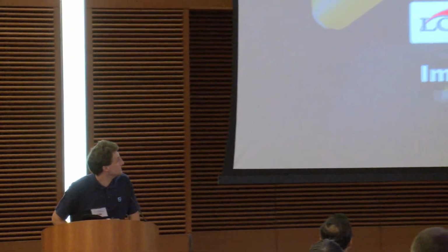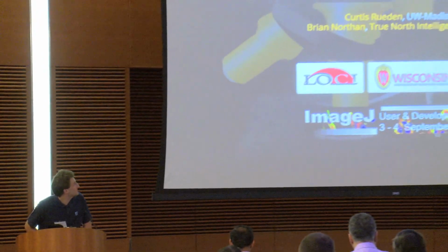So you'll get the most out of this workshop if you follow along on your machine and try things and play. I encourage everyone, we're going to open up lots of little script snippets, so I'll encourage everyone to play along and actually try things. But if you don't feel comfortable or you just want to watch passively, you'll still probably get something out of it.